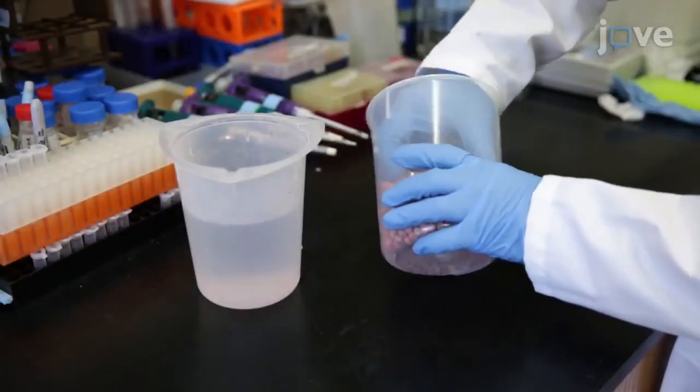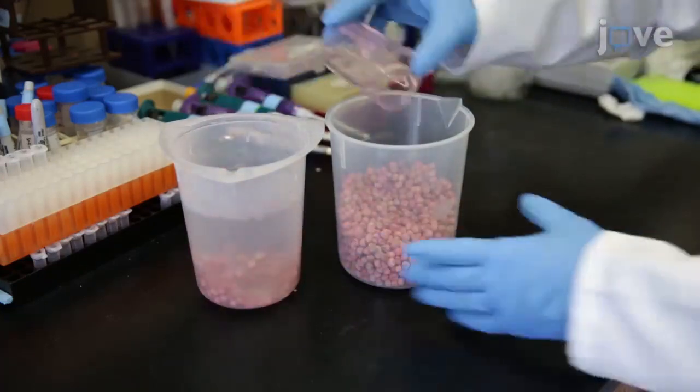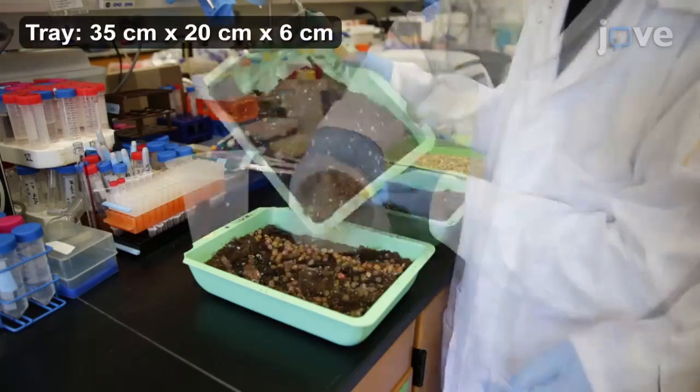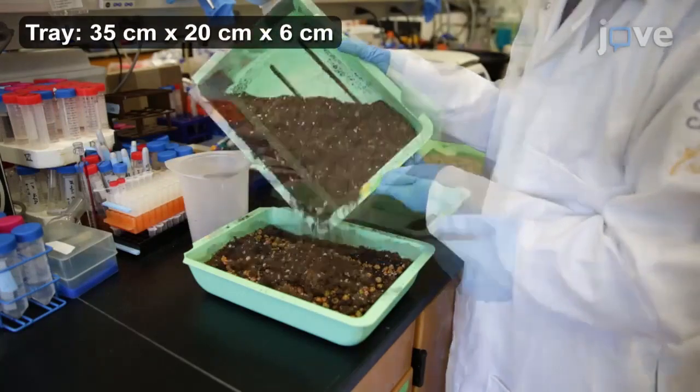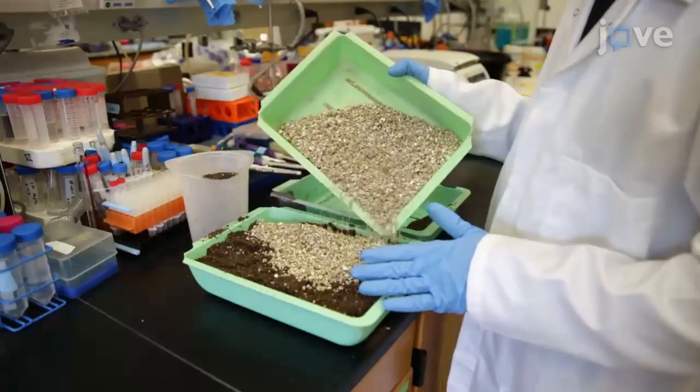Begin by soaking approximately 55 grams of peas in 400 milliliters of distilled water for 3 hours. Sow the soaked peas in a plastic tray in soil covered with a thin layer of vermiculite and grow for 9 to 15 days as described in the text protocol.